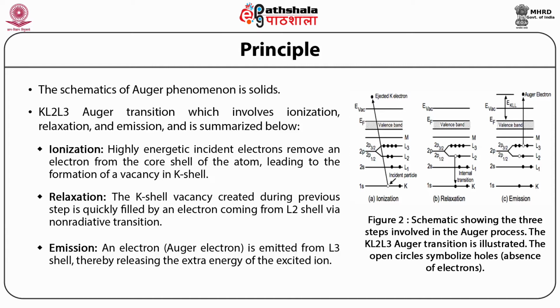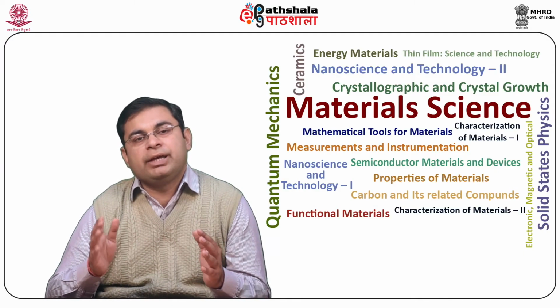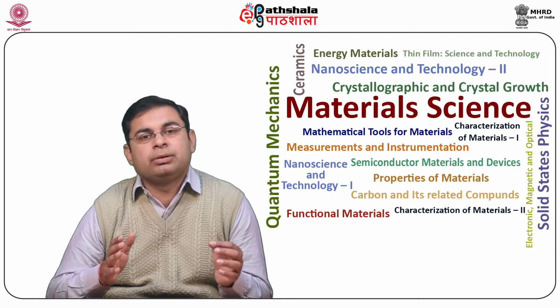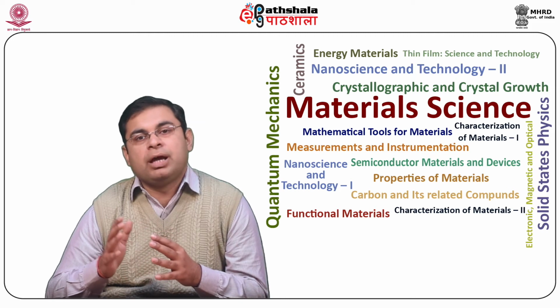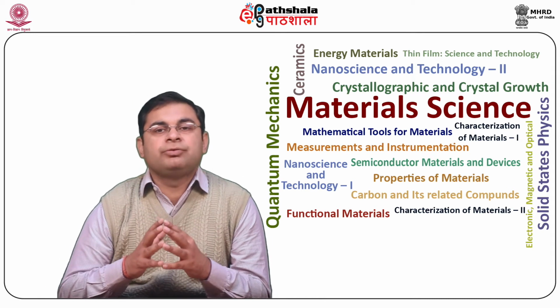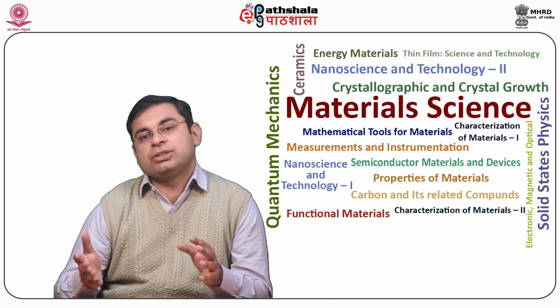Auger transitions are named on the basis of the energy levels involved in the process. Example: the transition involved in the above figure is named K L2 L3. In certain cases, such as atoms having high atomic number, many Auger transitions are available. However, most of them have a low probability of occurring. Further, some of the energetically allowed transitions are also forbidden by the selection rules.